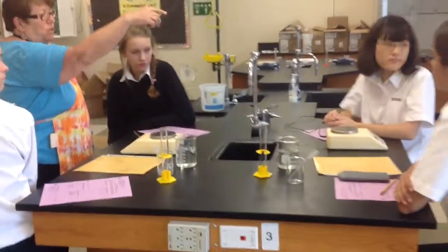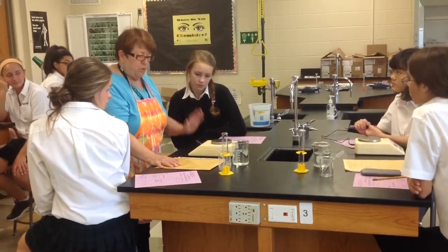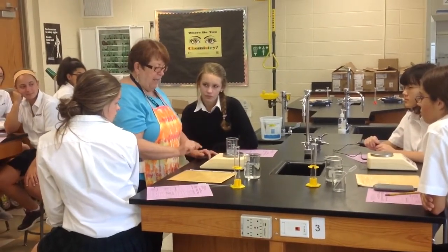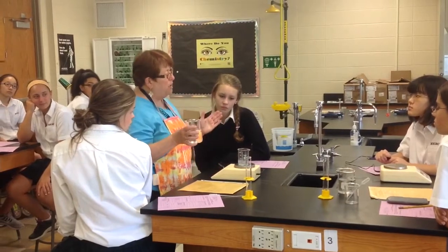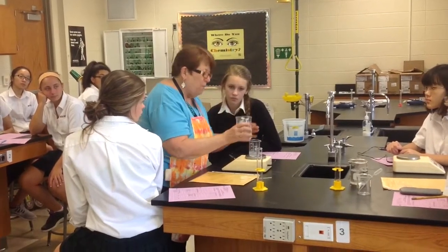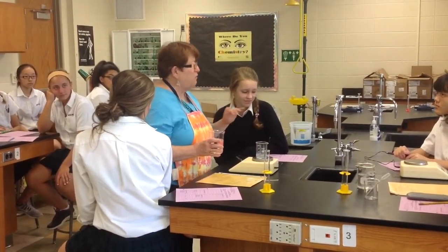All right, station 3 is these 2 tables here. So tables 3 and 4. Now this is one that can get really bogged down unless you do this, which you should be able to do quickly. You're going to take an empty beaker, put it on the balance, and then tare the balance so the beaker is zeroed out, right? And then you're going to add water until you have about 40 grams. There's a pipette here, but don't sit here going like this. Just pour the water in carefully, watch until it hits around 40. Do you need 40.00? No, you need around 40.